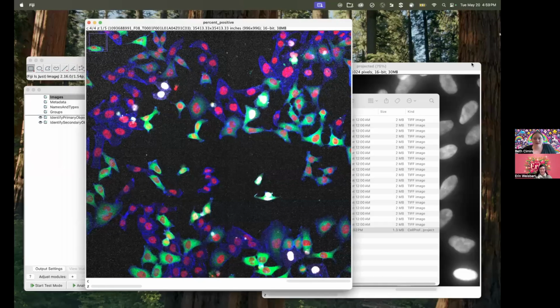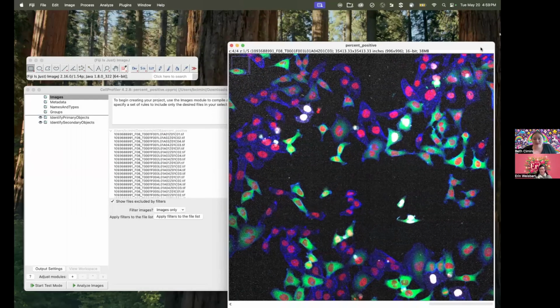So this is just some data that I've grabbed from the IDR, as we often do, where we have a nuclear marker, which is here in red, and a cell marker, which is here in blue. I just left FIJI on the default colors. As usual, I'm opening up new images in FIJI because I think it's easy to look at new images in FIJI. But we also have two different fluorescent proteins that are overexpressed, one that is a cell marker and one that is a nuclear marker.